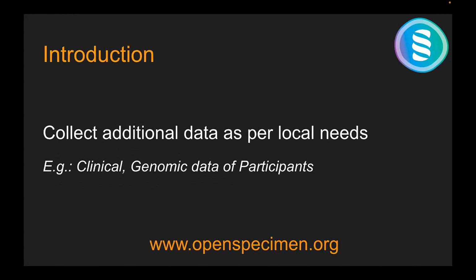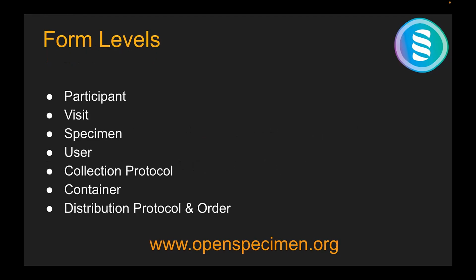First of all, what is the purpose of this forms module? The primary purpose is to collect additional data as per local needs. It can be clinical data, it can be genomic data, or any kind of data which is in addition to the default fields of OpenSpecimen. I think for able protocols, Brandon is already creating multiple custom forms so that additional fields will be recorded there.